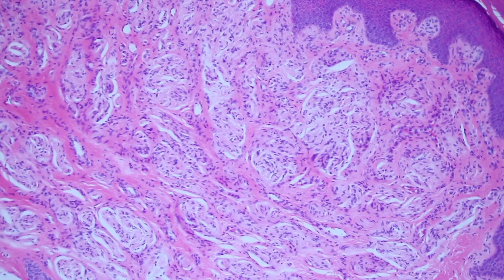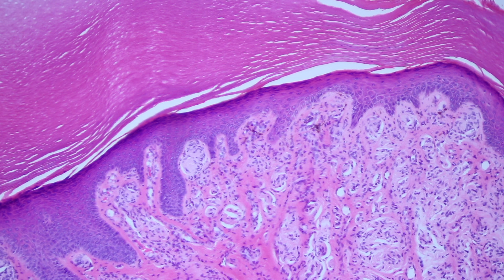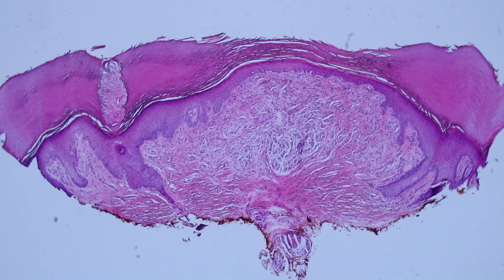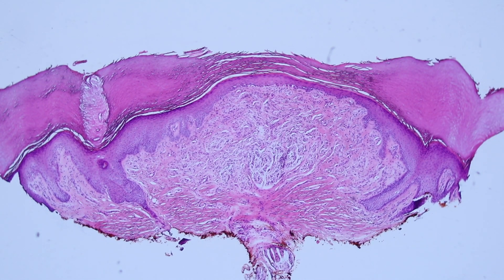So we have this tangle of nerves and we're on acral skin — specifically the distal fifth digit, the lateral edge of the pinky. Interestingly, this is a two-year-old child. That was from the right hand. Now let's look at the left hand in the same exact place — we have something very similar. There was a bump, like a mirror image on the other side, on both the right and left hand on the lateral edge of the fifth digit.